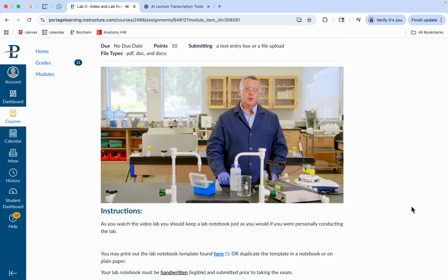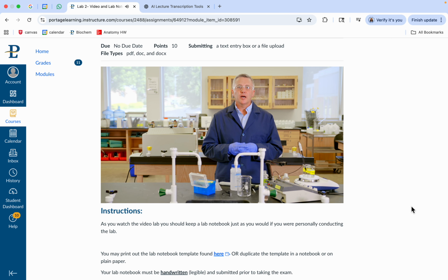This shows the importance of buffers, and also how biological molecules themselves can act as buffers and help to maintain the pH of a solution.